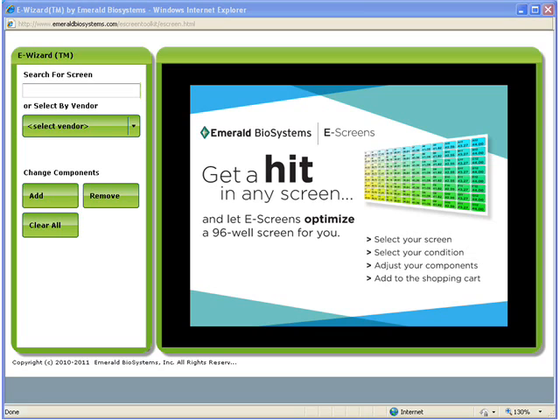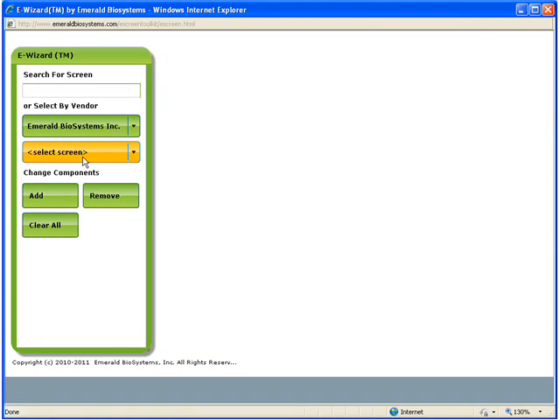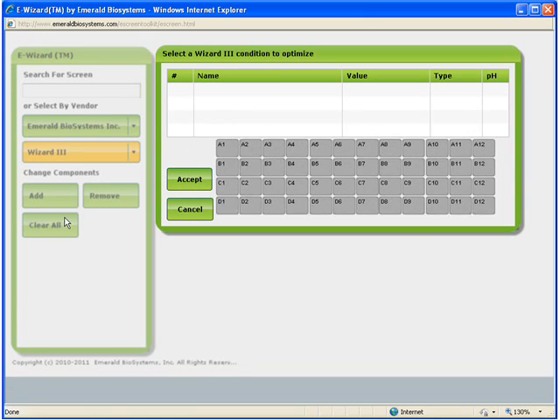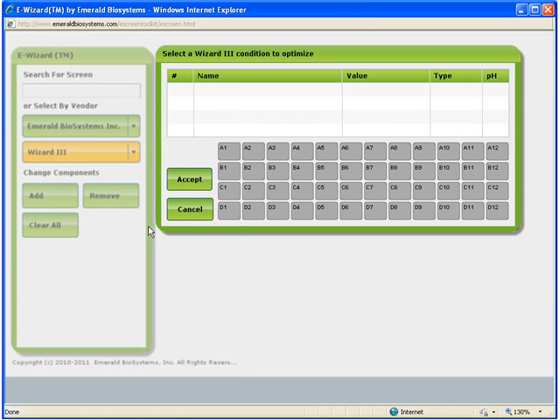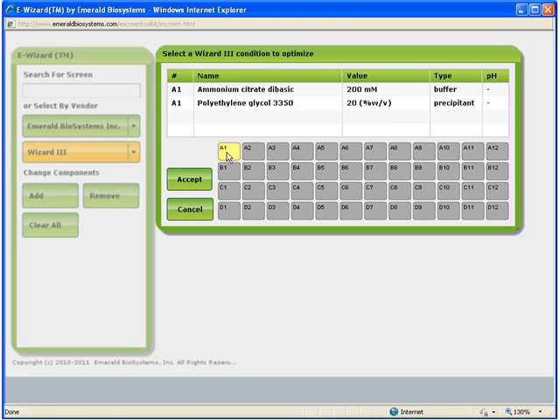When designing an optimization screen based on a commercial condition, first select the manufacturer of the original screen. I will select Emerald Biosystems, the manufacturer of Wizard3, and then use the next drop-down menu to select the screen, Wizard3. After clicking on the screen, an array pops up containing the data corresponding to the selected screen, so that when I click on A1, the contents of that condition appear in the table above.